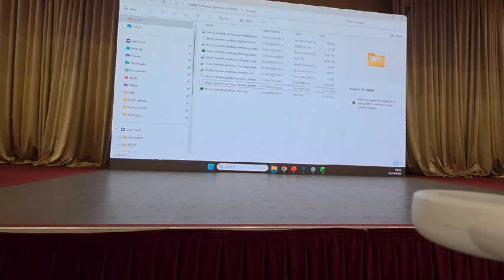I really wish this was here when I started my PhD because some of those files were spread out. Now there's no reason why it shouldn't be. And this makes it really nice for publication time because we really want to follow FAIR practices. So really making the data findable, reusable, and accessible for other users. So I can now easily upload this as attachments in a publication or as a Zenodo file.